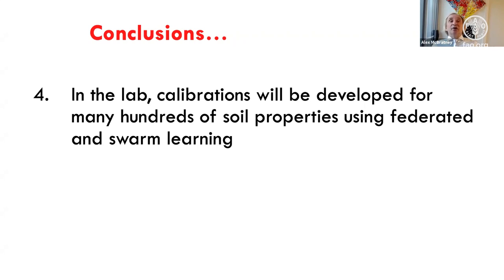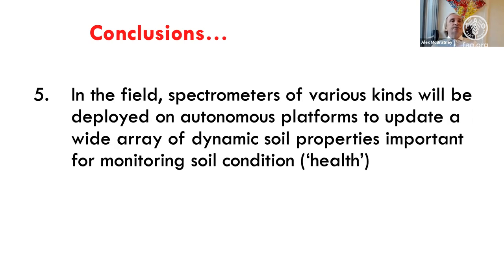In the laboratory, calibration will be developed for many hundreds of soil properties using federated and swarm learning. I see the federated and swarm learning as the way to generate calibrations in the future, which means that you will be collaborating with labs across the world, but you won't necessarily be sending all your data there. You'll be doing it in a more anonymous way using the idea of the blockchain. Next slide.